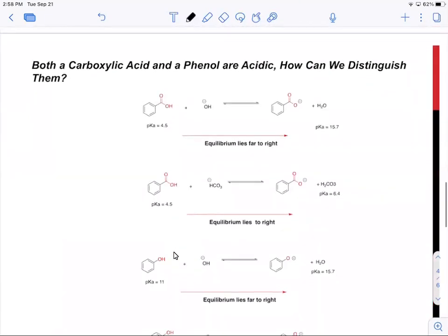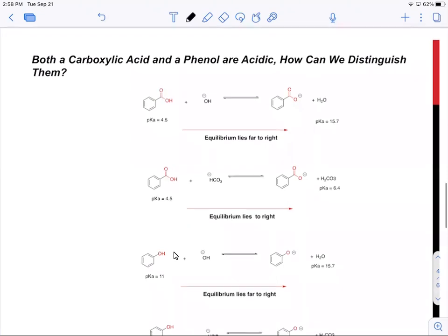So when we considered our various functional groups, we saw that both the carboxylic acid and the phenol are acidic. So you might be wondering, if I observe solubility when I treat with base, how do I know which one I have? Some of the other analytical techniques we're going to learn about in this lab might help to distinguish those. But there's one additional piece of solubility information we can get that may help us to get a head start on that distinction. And that is to use both a strong base and a weak base solution.